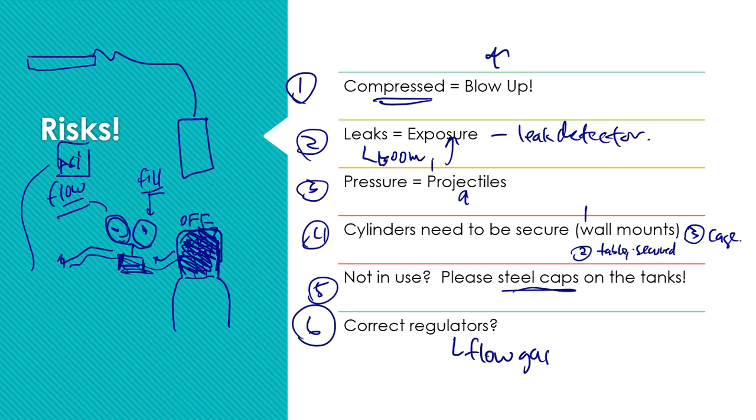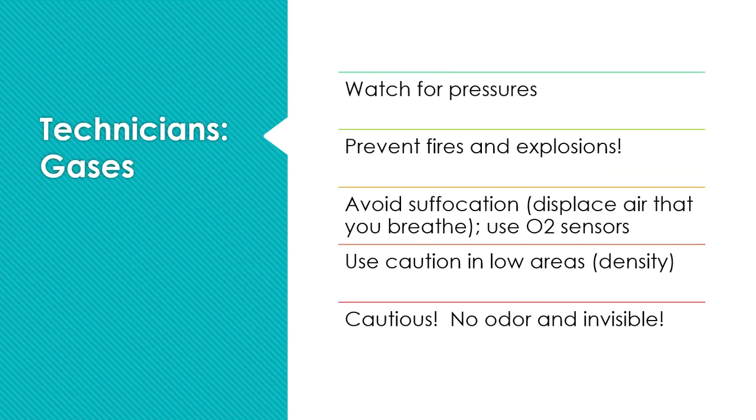So as my job as a technician, all of these are things that we've got to keep in mind. However, in addition, if I want to recap, one, pressure, pressure, pressure. I'm going to talk like a real estate agent: location, location, location. Well, in this world with gases, it's pressure, pressure, pressure. That's what these are. So watch out for those pressures.